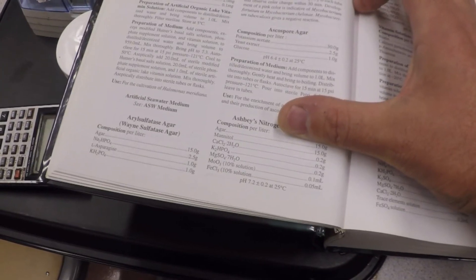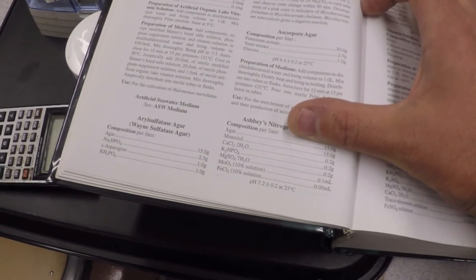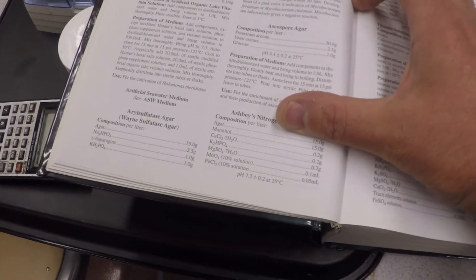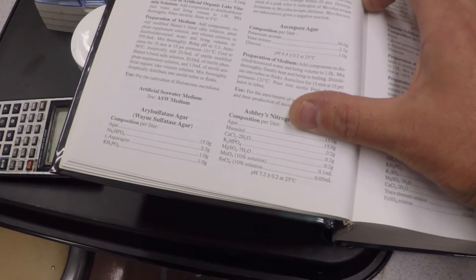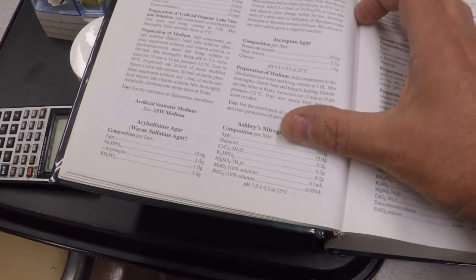Mannitol is a carbon source. There's micronutrients in there, elements like calcium and potassium, magnesium sulfate. There's iron. There's molybdenum. What is it that we're missing in this thing?